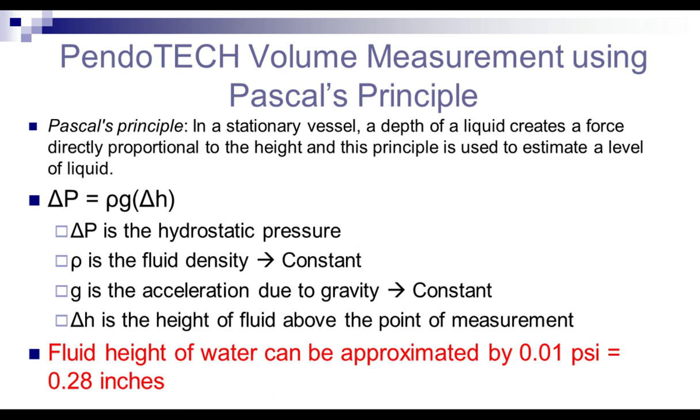It needs to be placed in the same position for all measurements. Basically, this corresponds to the plate being welded to the same position in every single flexible bioprocess container being used for this application.